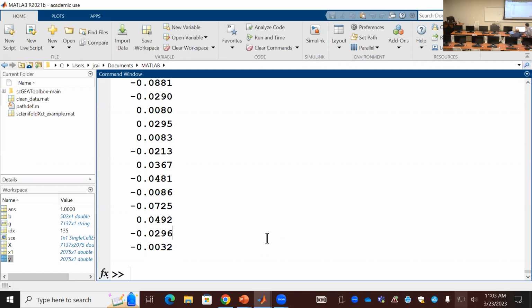If I have that, I can put a predefined cell score, and then I don't know if I have M1, M2 there. But yes, we can build that in there. You can use this already there. Then you can compute the values for the genes for each category.